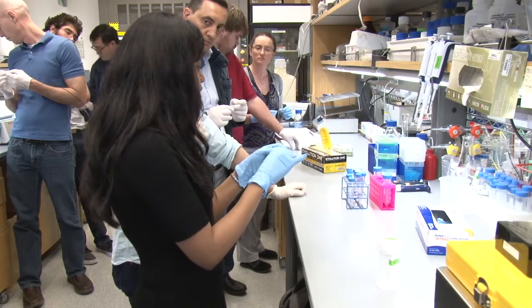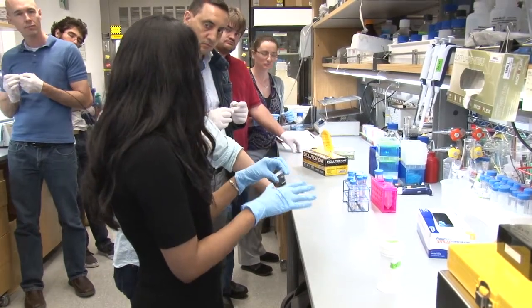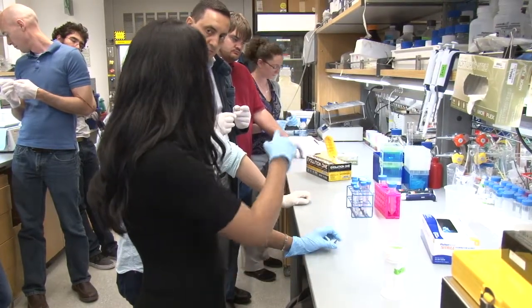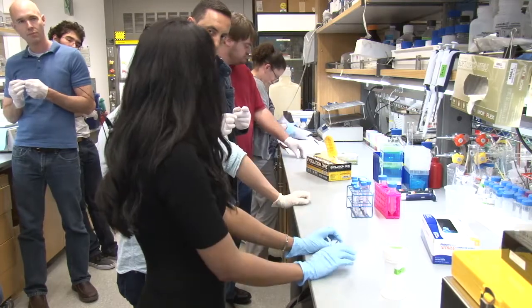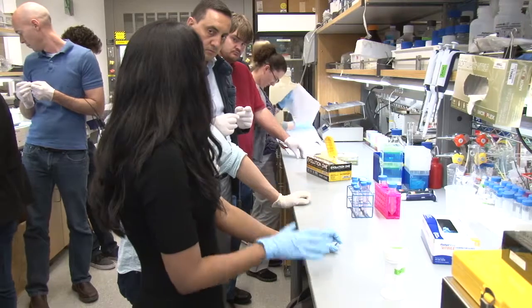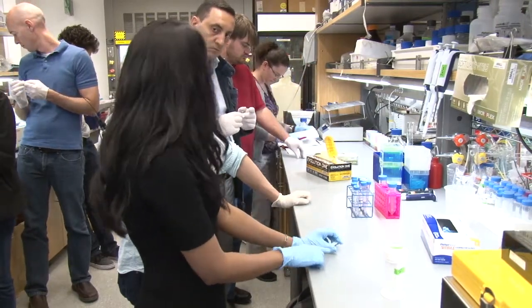Once you're done with that, the next step is to do a post-fixation. We do post-fixation with 3.7% formaldehyde — the concentrations are in your handout. We also add about 0.1% of DEPC along with the fixation, and you would fix this for about 20 minutes.